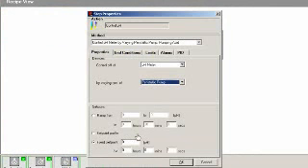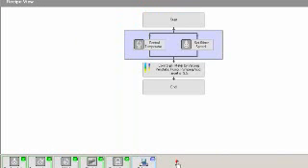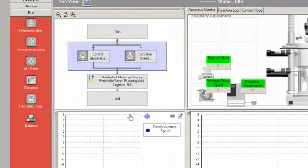Sophisticated actions such as pH control using a pump and pH meter or gravimetric dosing using a balance and pump are made easy.